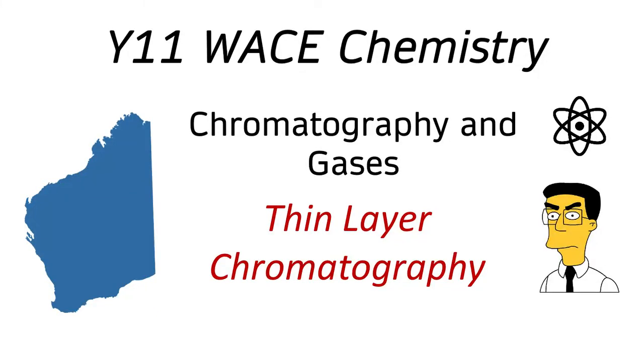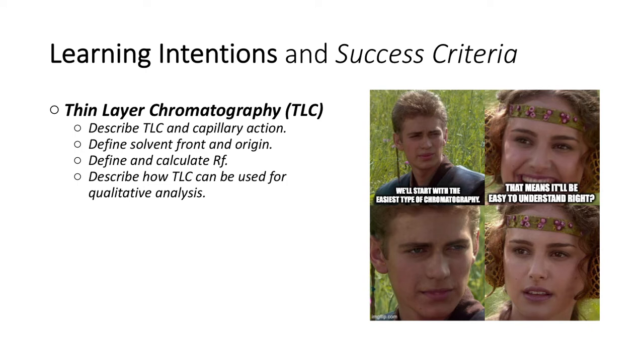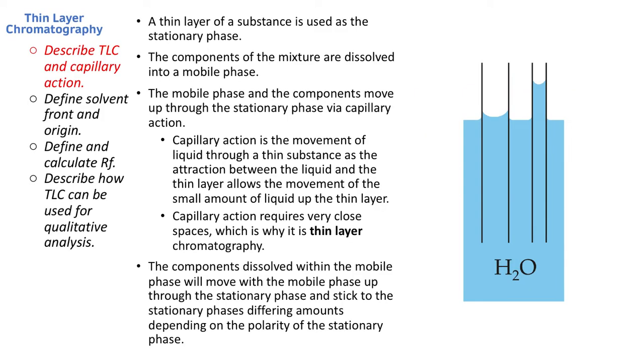Lim here again, and this is our video on thin layer chromatography, one of our first chromatographies that we're going to learn about. Right, so we're going to work out what thin layer chromatography is, get some definitions, and work out how it's actually used in analytical techniques.